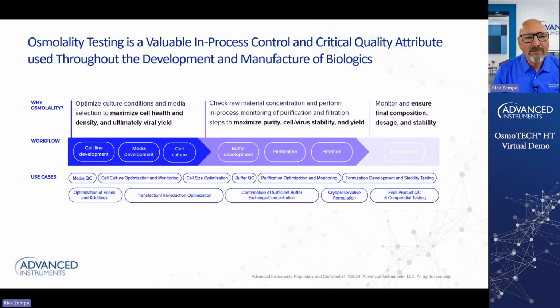Okay. Now we're going to focus on the OsmoTECH osmometers. Let's discuss some of the applications of osmolality in the biological development processing. Starting with cell line development and through cell culture scale-up, osmolality can be used to confirm concentration of media, feeds, and help you gain insight into the scale-up steps.